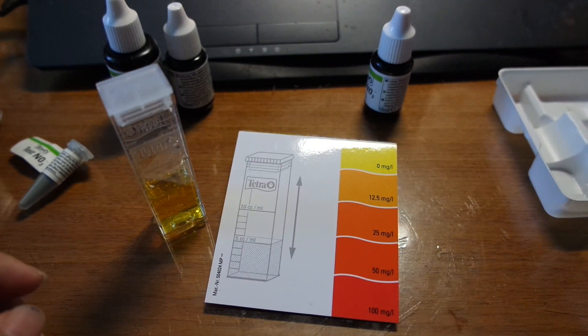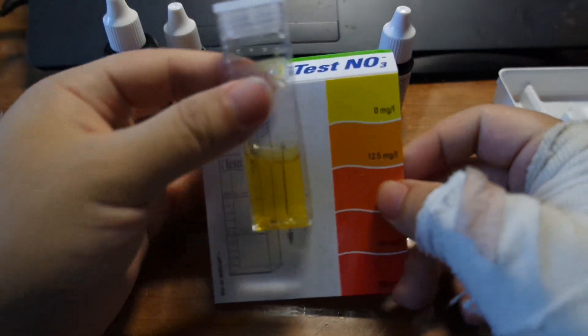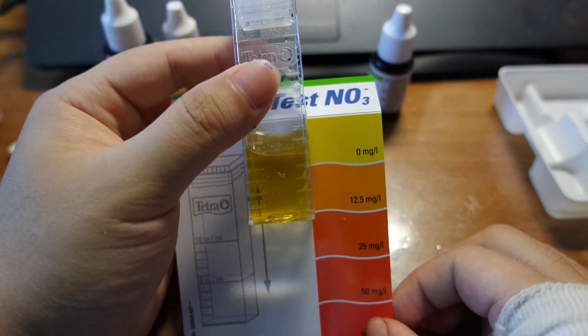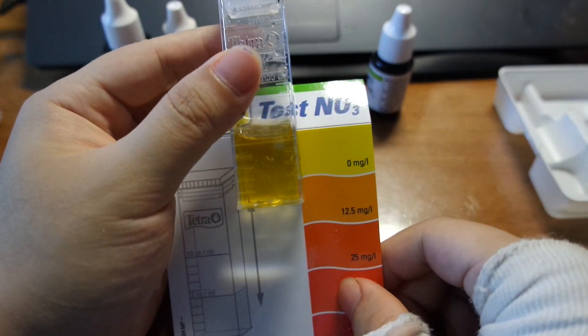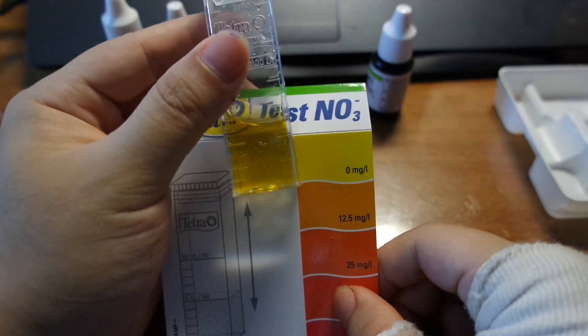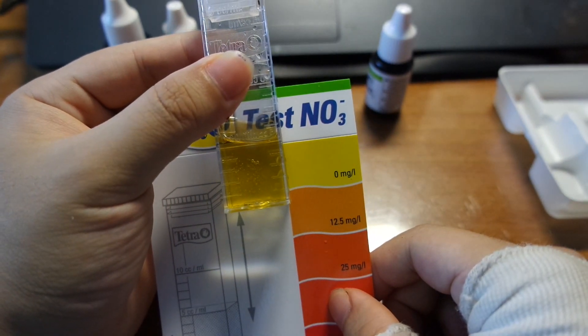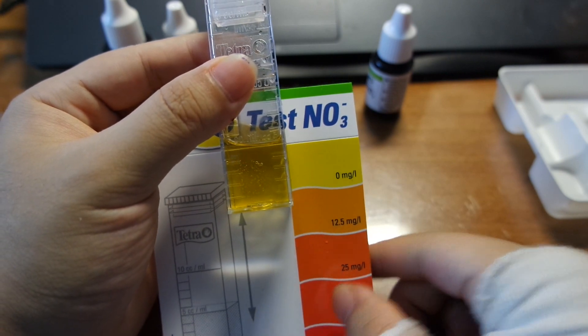Okay so it has been about 10 minutes and the reaction is done. Basically you set it up there and you see where the tank is at and you can see it is right about 0 there. Yep so my nano planted tank has practically no nitrates in it which is good. Moving on.